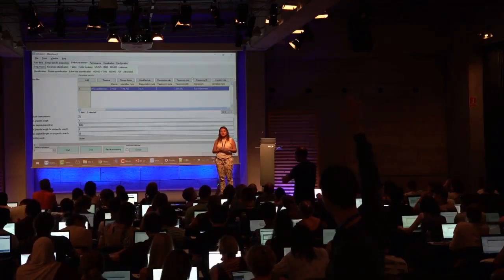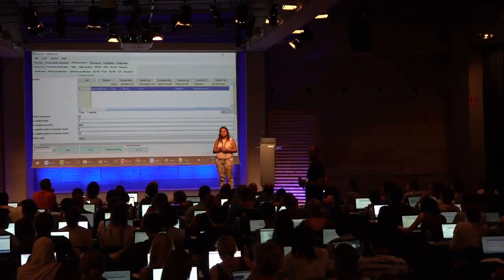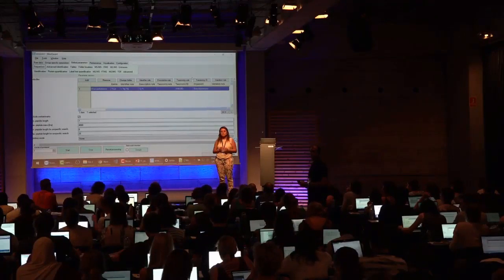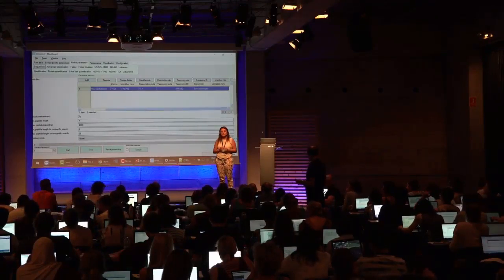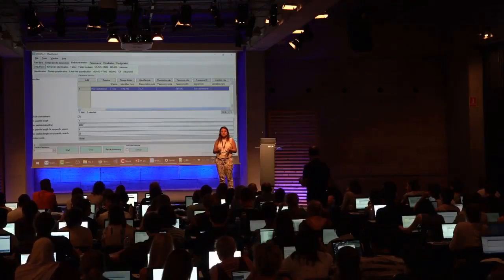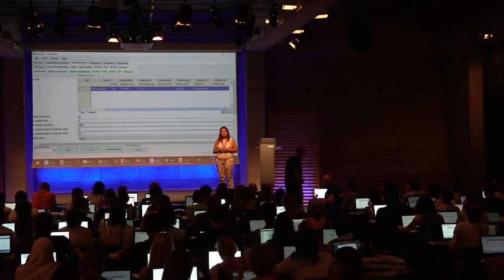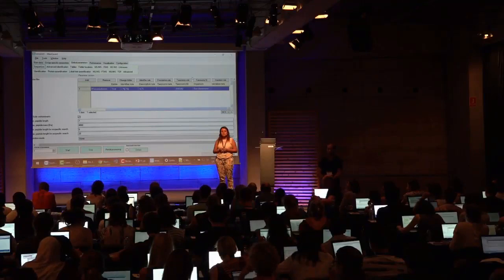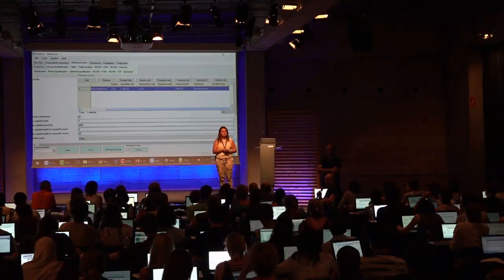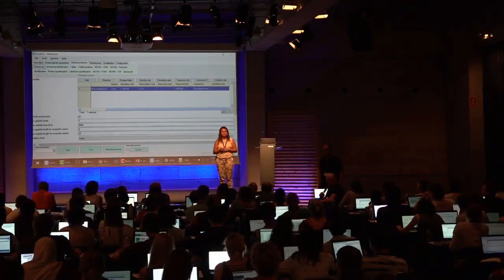Okay, thanks. A question about the same taxonomy ID field. Does that need to be filled? I'm asking because for those who do ancient proteins, we're working on organisms that do not have taxonomy IDs allocated to them. So you want to add your own taxonomy ID or what? Our animals are quite often not present in GenBank ID systems, and so we don't have a number we can put in place. Jürgen already has answered this. You don't have to fill it. If you don't need it, you can also leave it empty. That's the answer I was looking for. Thank you.